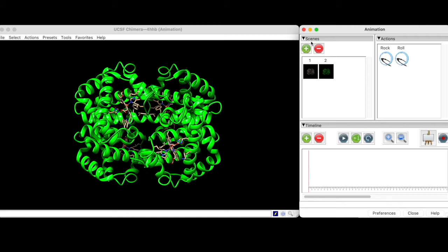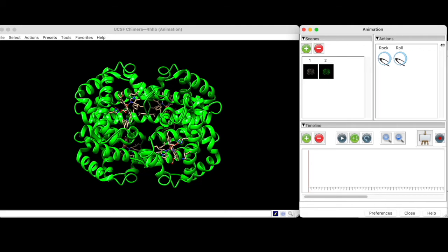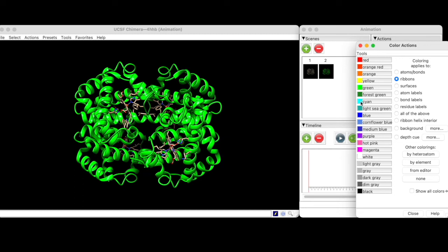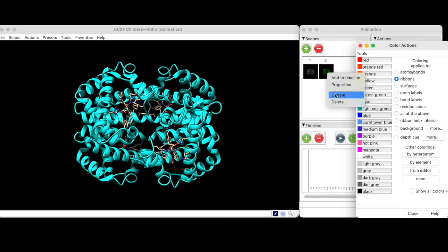It is also possible to update keyframes once you have created them. Let's say that you want to color the protein ribbon something other than green. To do this, we first make the desired change, and then right-click on the corresponding keyframe and select Update. Now that keyframe contains the change made in the graphics window.